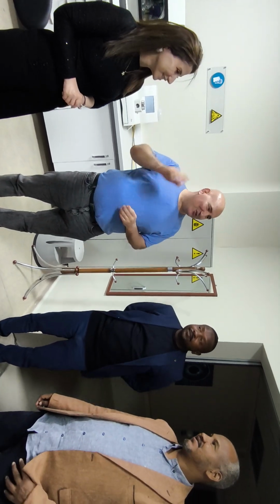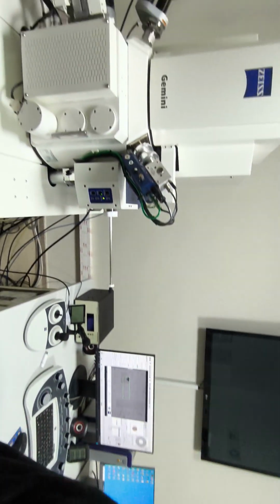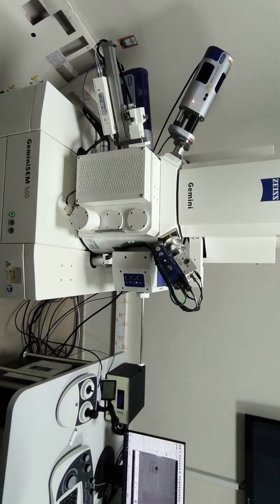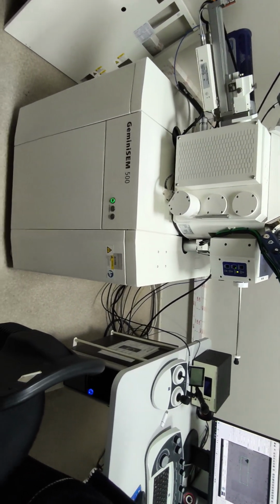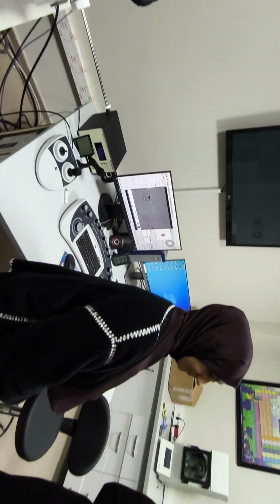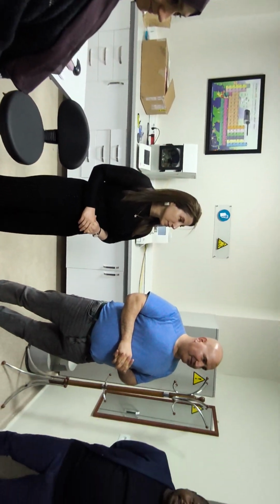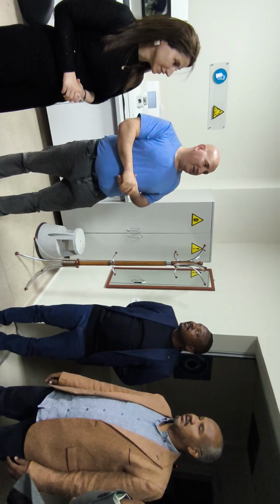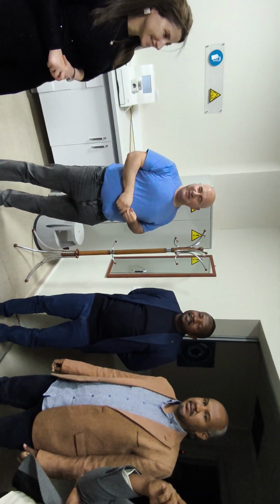The only thing is, when you use this device, the more conductive your sample is, the better pictures you will have. Be careful, any impurities inside you will see directly if there is any problem.